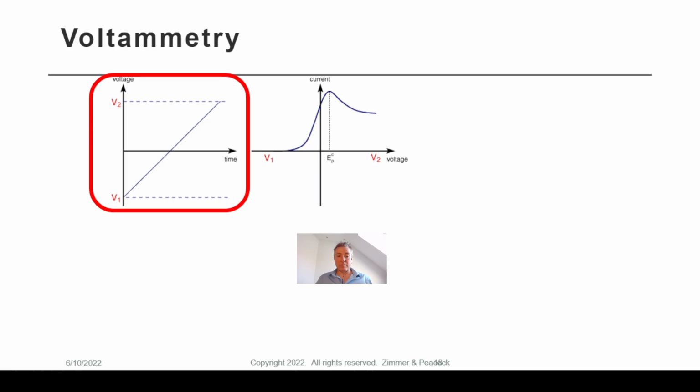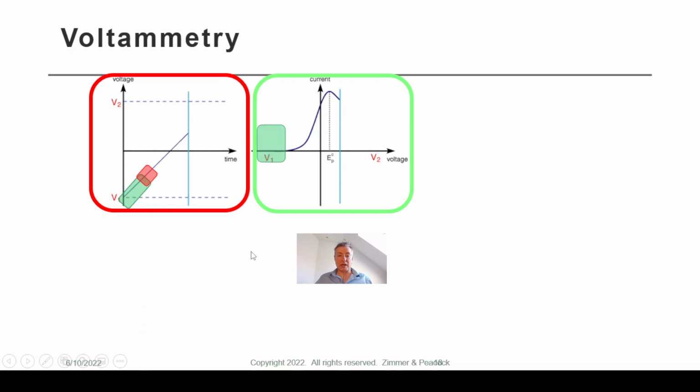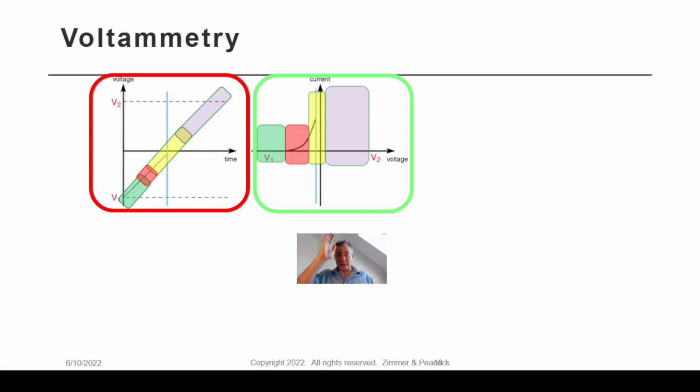So here I'm showing you that as we scan along, we get a voltammogram as a result of it. And I did explain that in this region we're essentially in our background region, because the voltage is not near any kind of critical value. Then we come to our kinetic control region, which is essentially here when you look at the voltammogram. Then we come up to our mixed control region, and then our diffusion control region. And we start getting this iconic peak and then this fall off.